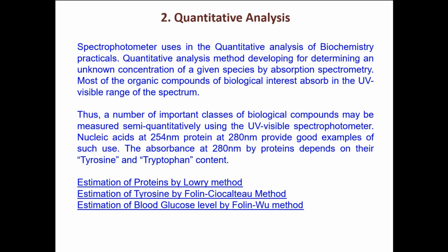Using those methods we get the optical density of a sample, and then we incorporate that in the formula, and then we can calculate the amount of compound present in the sample, even in biological samples, not only in pure compounds. So you can also characterize and quantify biological samples.